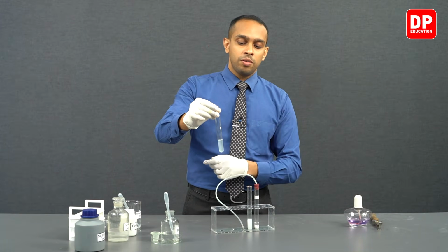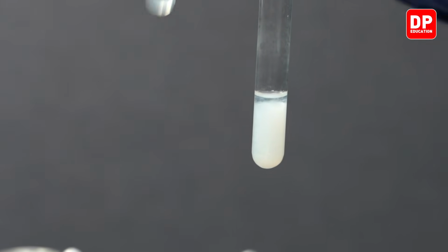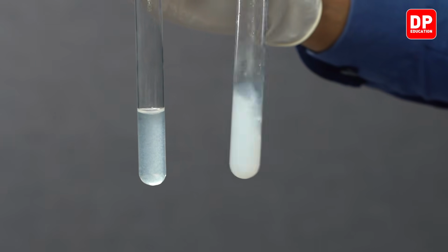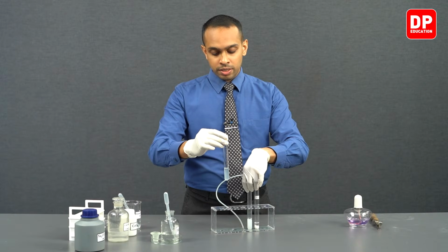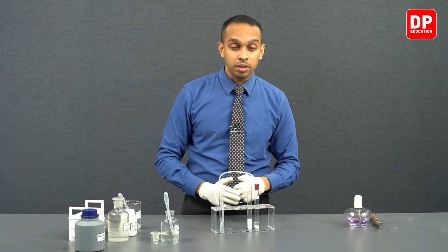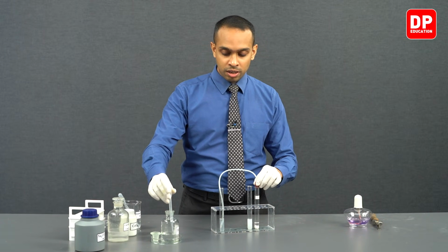Now we have a diluted version of this milky solution we have here. What we have here on the right hand side is a diluted suspension of this milky suspension I have on the left hand side. So now we will send carbon dioxide through this diluted milky suspension we have and observe how it turns clear.